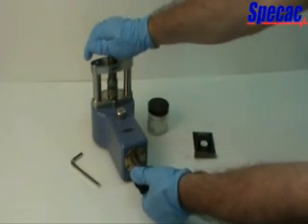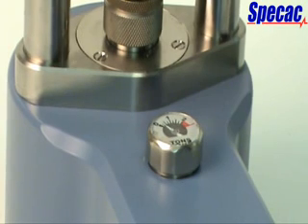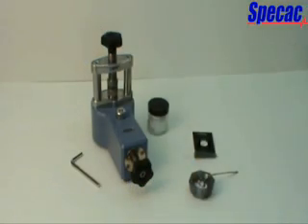Begin applying a load by turning the pressure knob clockwise. Continue turning the pressure knob until the pressure gauge needle is pointing at the 1.75 tonne division indicator. At this tonnage load reading, stop turning the pressure screw knob assembly as there will be a sufficient tonnage load to compact the KBR powder together to form a pellet.